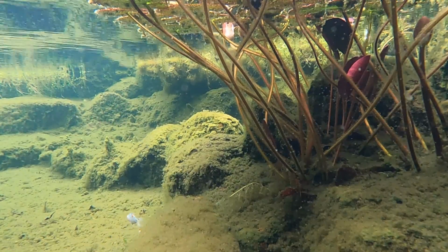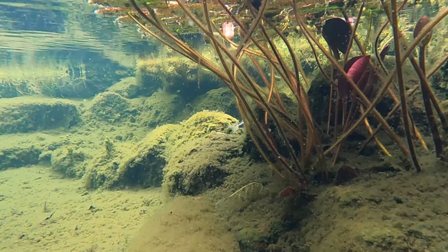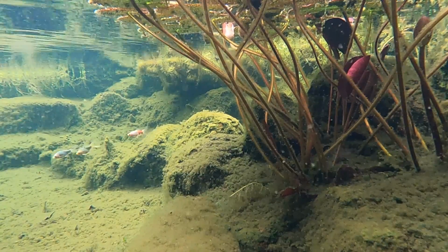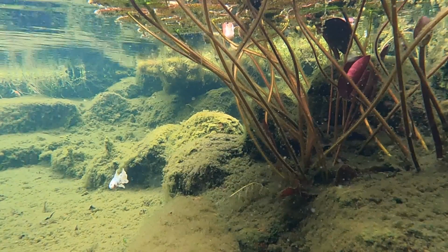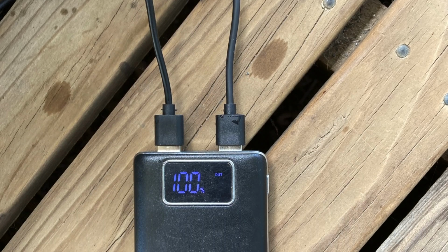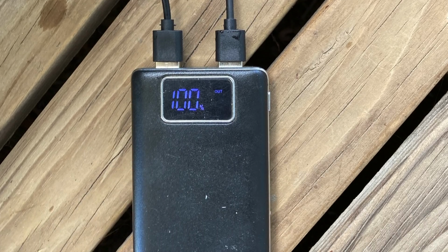So the unit's designed to be placed in one pond or aquarium and left there so that you can monitor the parameters every day. For me, that's not personally useful. I have lots of ponds, and I certainly couldn't afford to put one on each pond. Although having the USB plugs is really handy, as I can now easily move it around to different ponds if I want to do a quick test on the temperature, pH, or TDS.